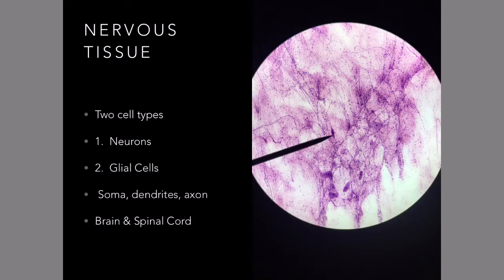When we look at nervous tissue on a histology slide, there are two general types of cells. We see what are called neurons, which are the functional units of neural tissue — the actual units that are receiving, processing, and sending information. However, that requires a lot of support, done by what are called glial cells or neural glia. If you look at this tissue slide, you see some very characteristic structures — these little star-shaped structures with a large dark nucleus in the middle.